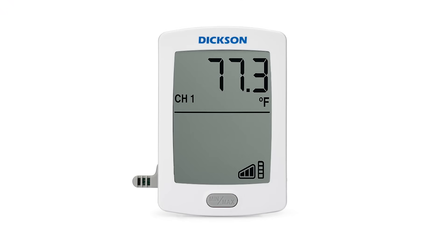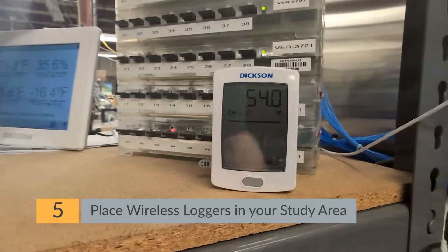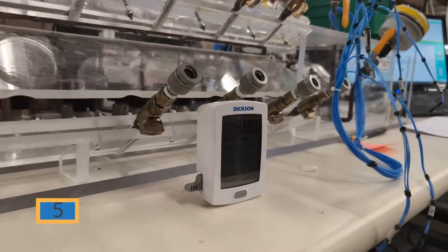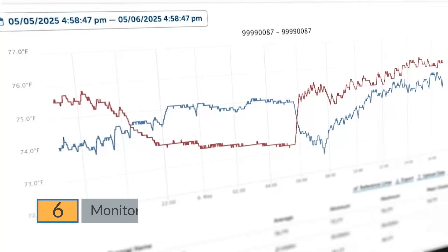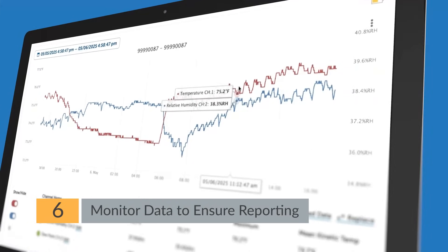Once placed, each logger will automatically update with its location ID. Step 5: Deploy your loggers. Use the location ID on each device to place the loggers in their assigned physical location. Step 6: Monitor live data. See real-time data as it comes in — no more waiting or manual checks.